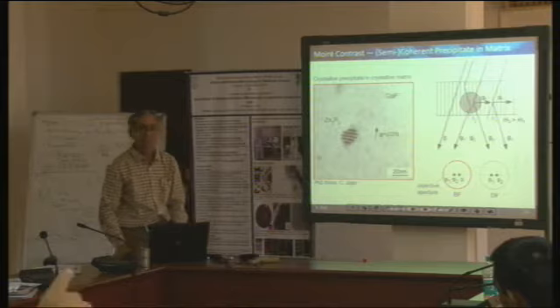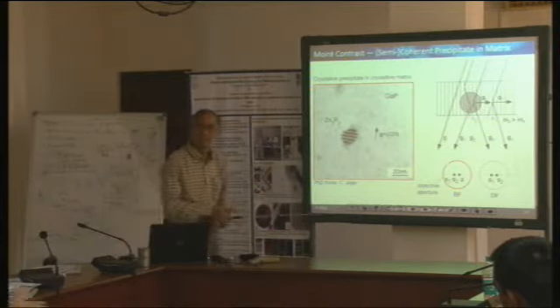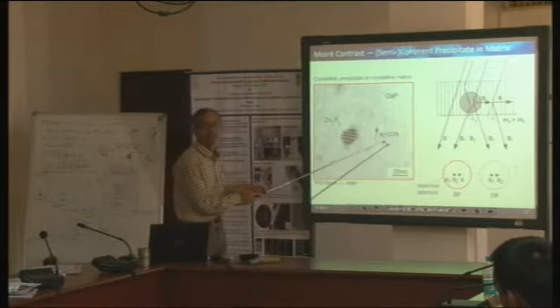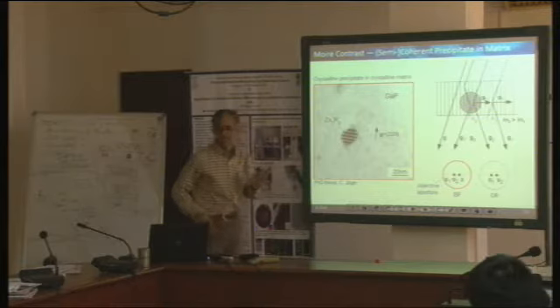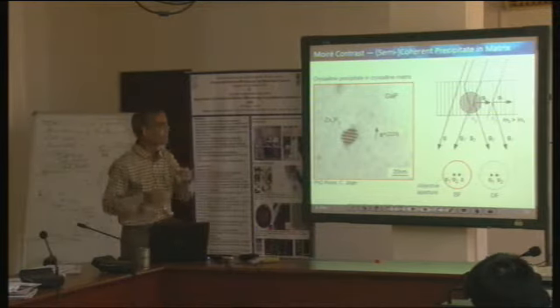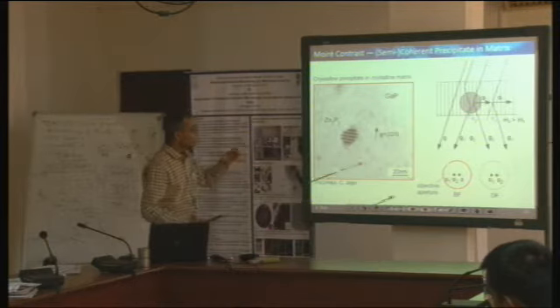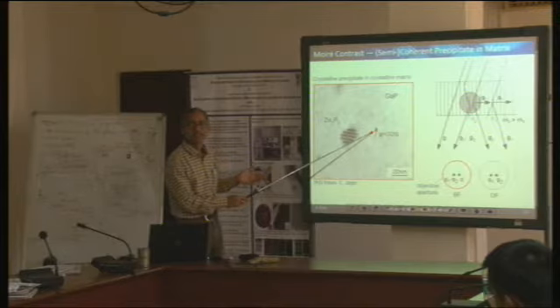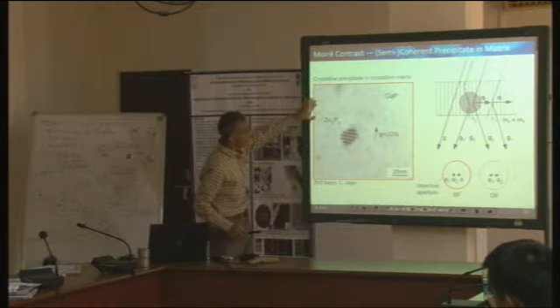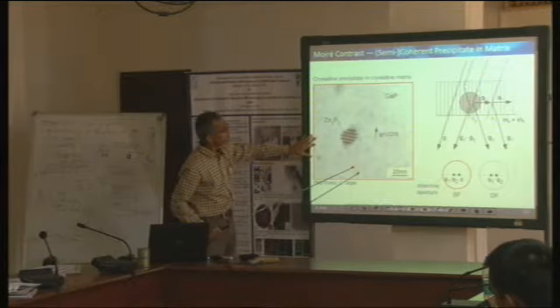How is the G vector indexed over here? What you were also asking is why, let's first ask why, is this indexed here as G? Because this particular image is definitely a dark field image.